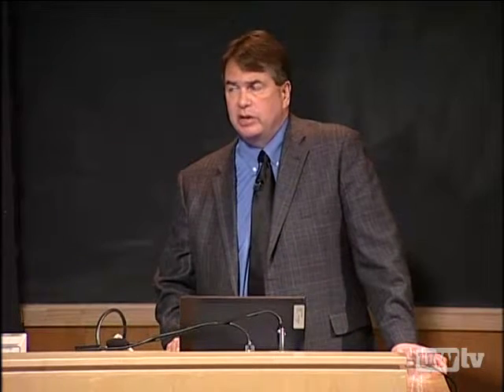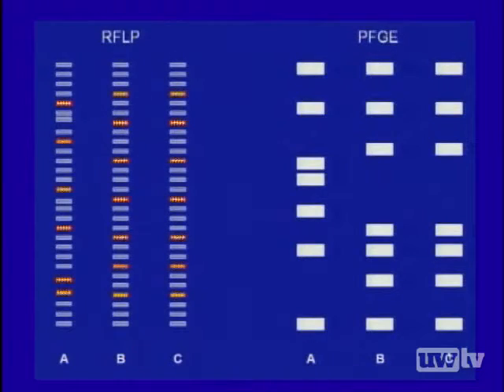But for an RFLP, you often will have to use a hybrid. You will have to hybridize it with another DNA molecule for particular segments. And now you can see that B and C truly are identical to each other. An example of that is the insertion sequence IS6110 that you see when people are doing the RFLP for TB. That is a reporter that they have hybridized on there to show where that IS6110 shows up in all of these fragments.